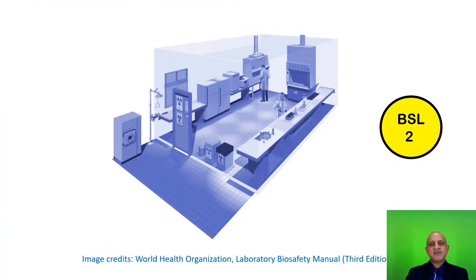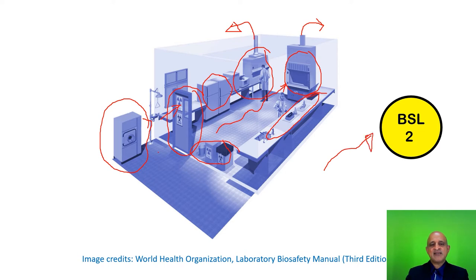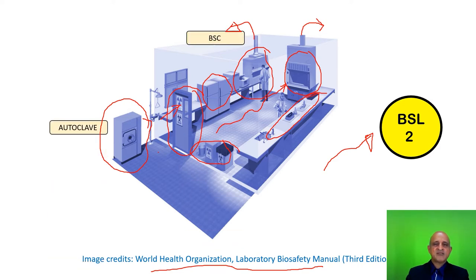This is the layout for a standard biosafety level 2 laboratory. It commences with the location of the autoclave adjacent to the door. The door is equipped with adequate signage and maybe a keypad for entry and access. There are containers for the disposal of waste. The biological safety cabinet and fume hood are located at the far end of the laboratory, ensuring the entire area is clean as air flows over the area and exhausts into the environment via HEPA filter through these two cabinets. There are also suitable working areas and refrigerators for storage of the biological agent.